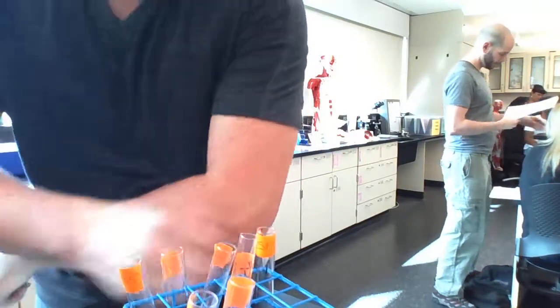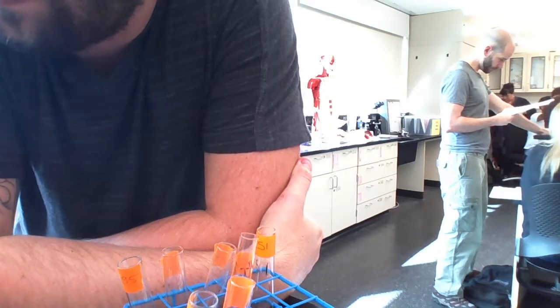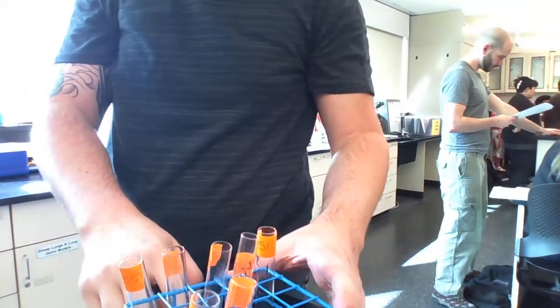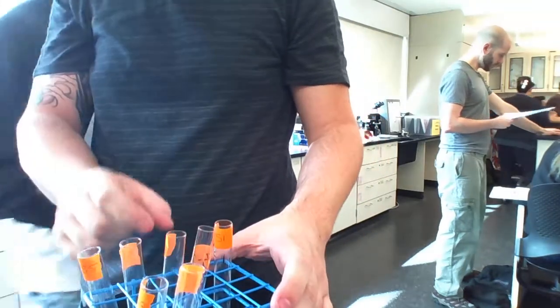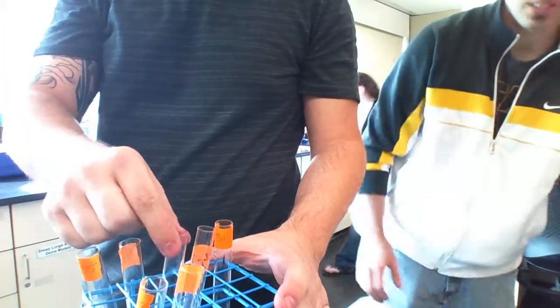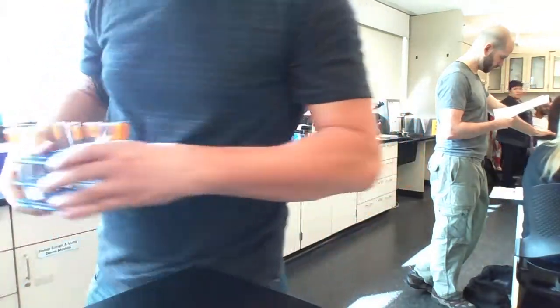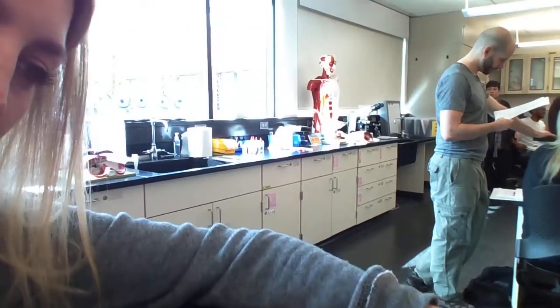Okay. So what have you done? Alright, so now we stick them all in their homes. So, bring those over here. So everything's in, one of them got boiled, blah, blah, blah. And now we're sticking them all in for an hour. Actually 2 of them, the 5A and 5B, are going into this ice bath, which you can see here.